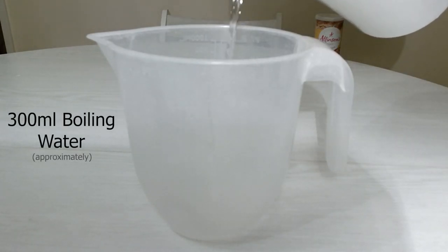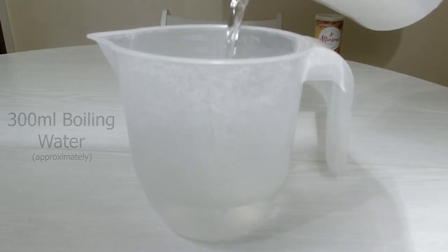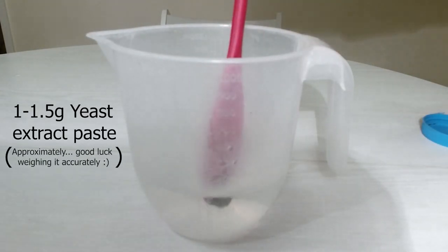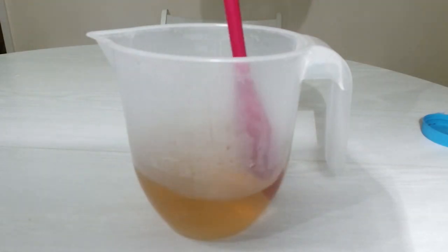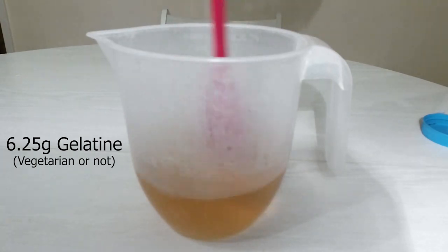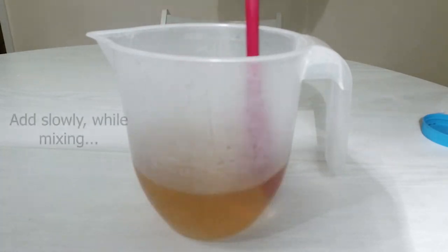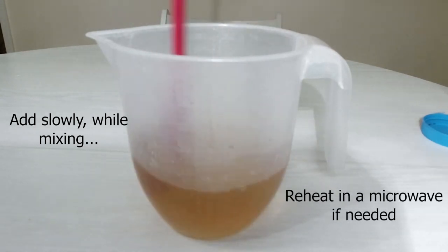First, I add the salt to the jug as it's the easiest ingredient to start with, followed by the correct volume of boiling water. Once the salt has dissolved I add the yeast extract using a mixing spoon and mix it well until everything is dissolved. Finally, I add the gelatin powder in small amounts, mixing constantly until it's dissolved. Adding the gelatin too quickly will cause it to form large lumps that will be difficult to remove. If the gelatin does not fully dissolve, you can gently heat the mixture in a microwave to help it dissolve fully.